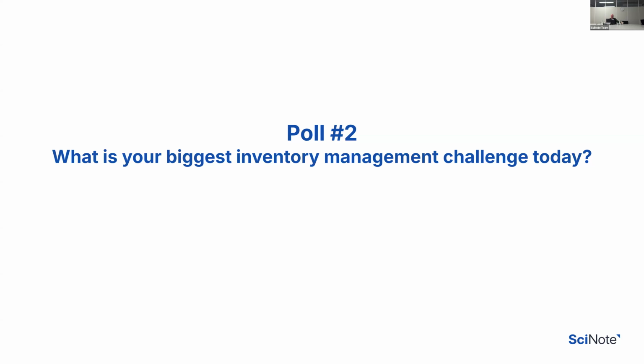And those are coming in for the same one. Okay, misplaced or untracked items. Yeah, that one is very common, especially in some equipment. What we saw, just a fun fact, and I hope this is going to be the future: RFIDs. Some of our customers are actually tagging their equipment with RFIDs, so if somebody moves it to another location, you always know where it is.